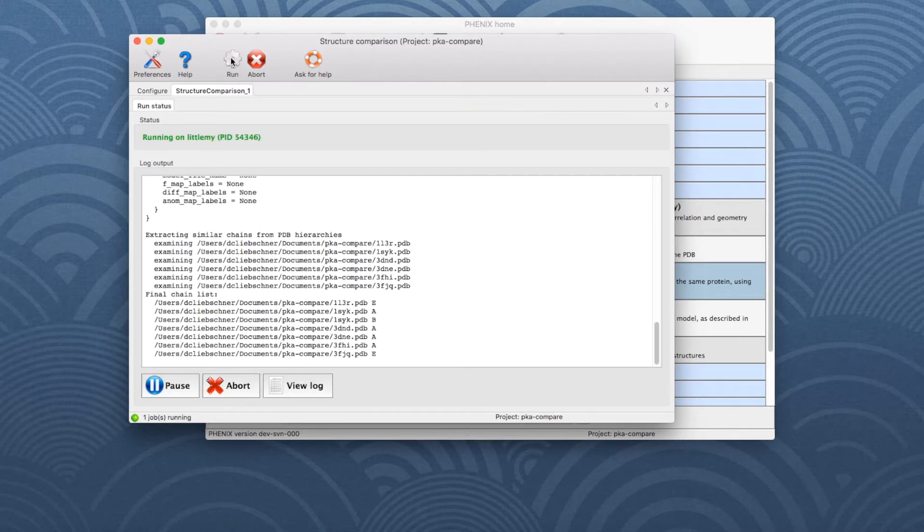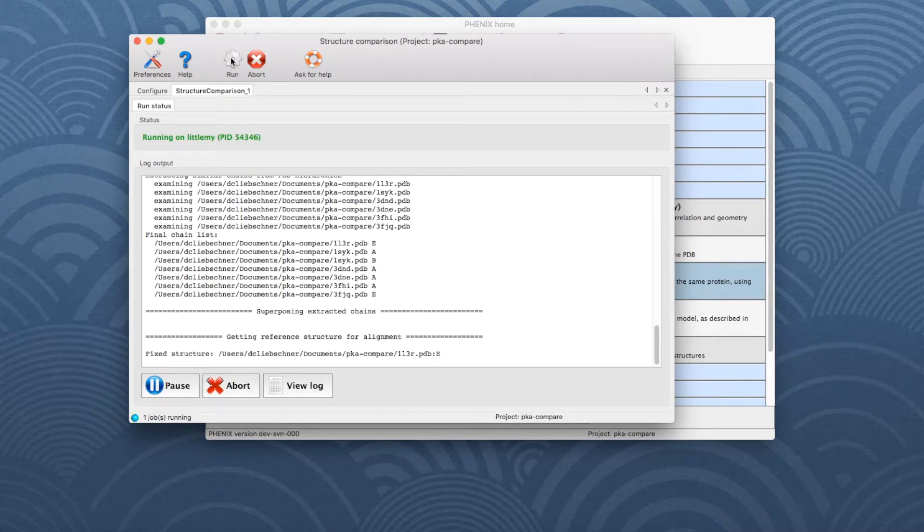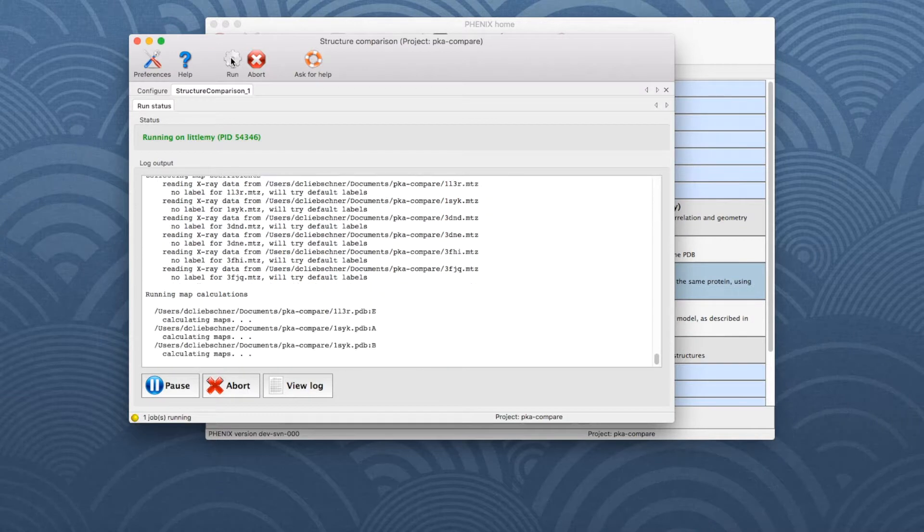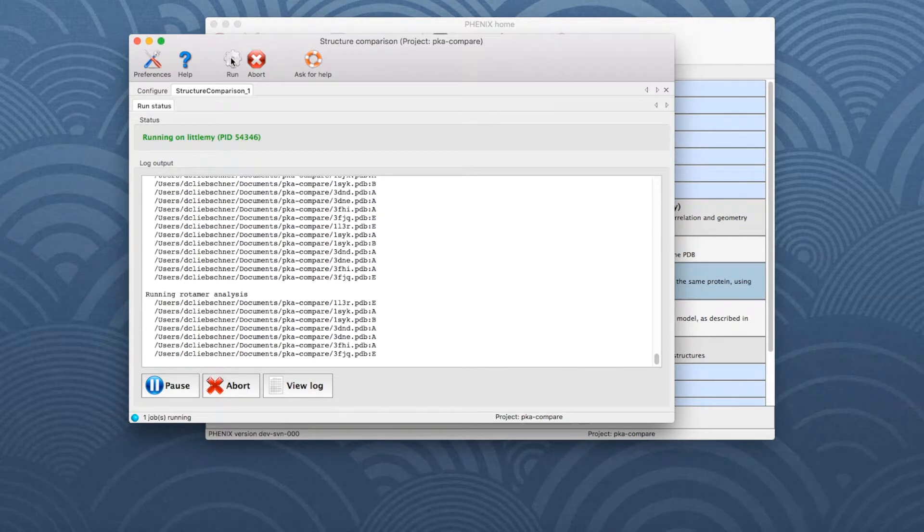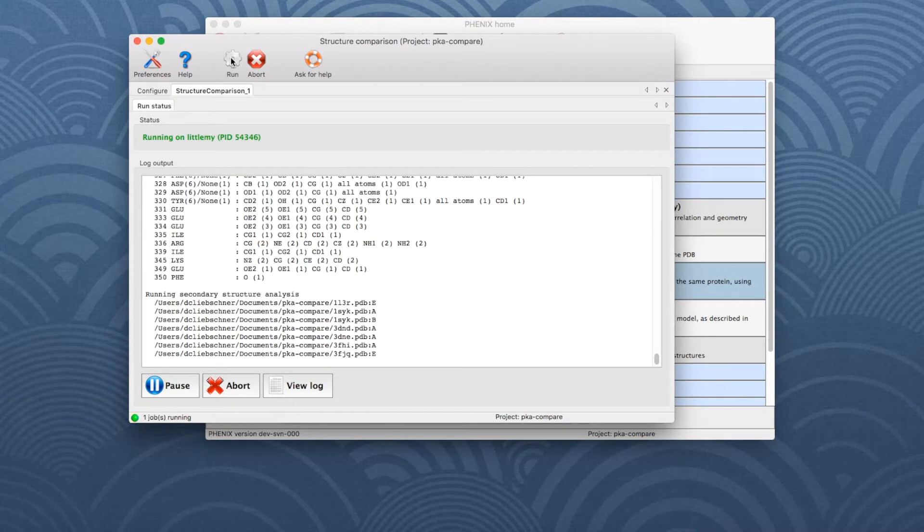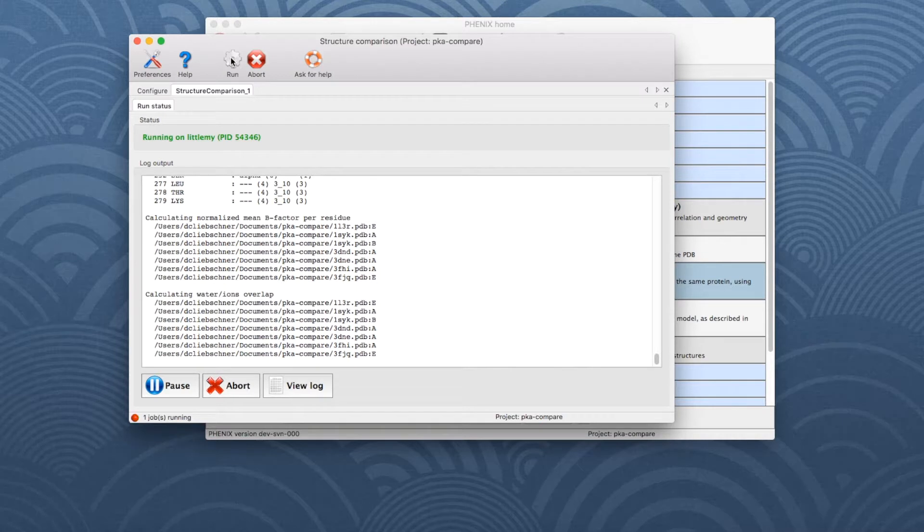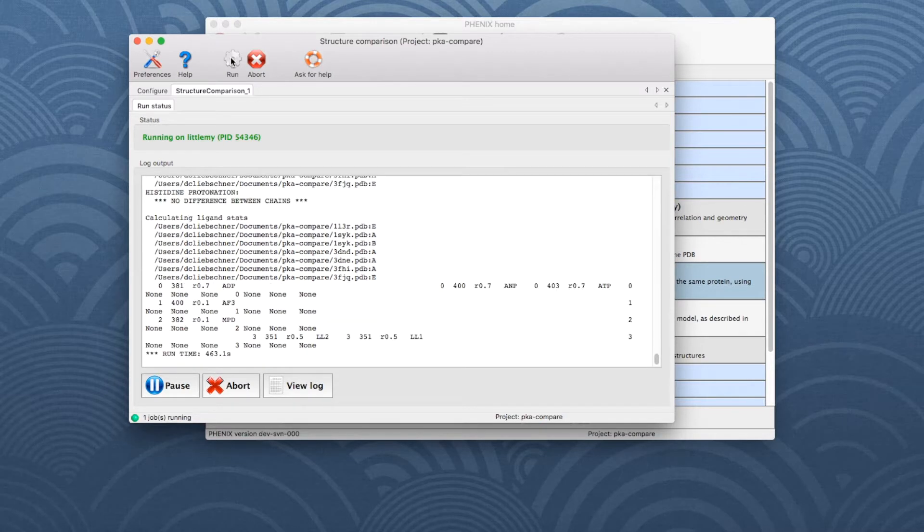If diffraction data were provided, maps are calculated, which can be time-consuming. Therefore, if files with map coefficients are available, it is recommended to use them instead.